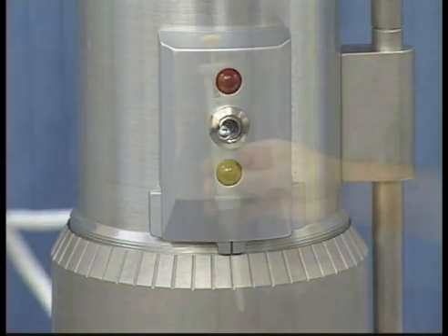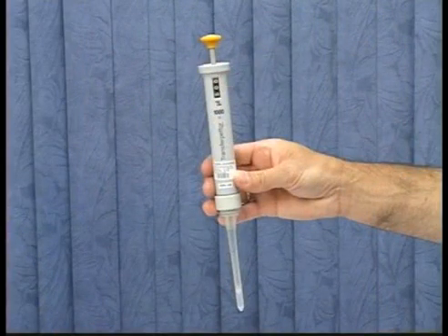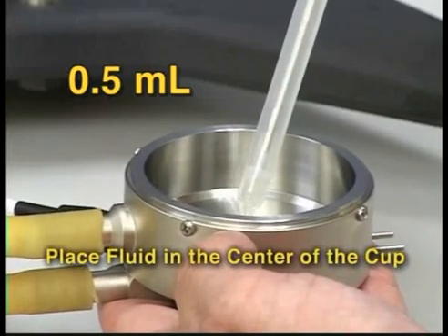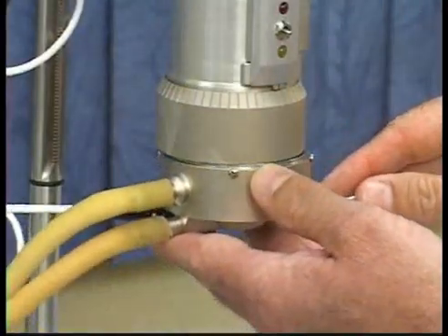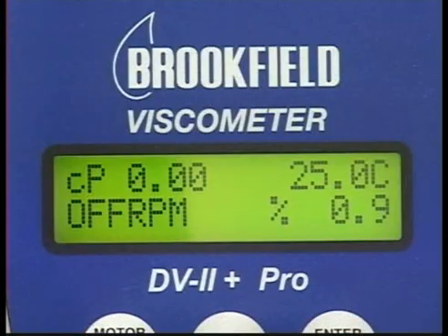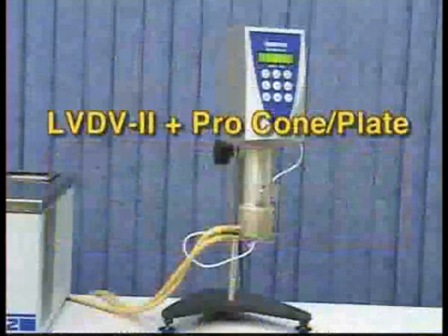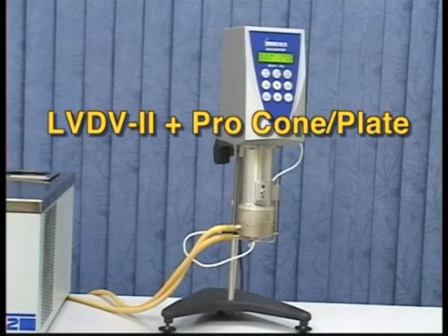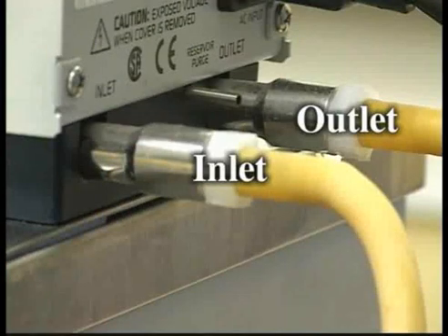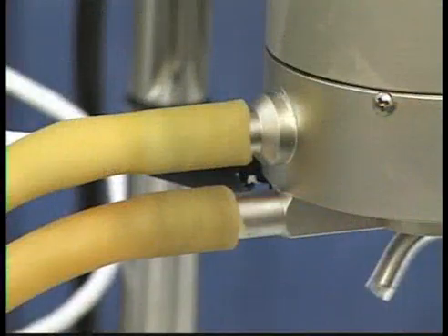With the gap properly set, measure the correct amount of viscosity standard fluid to be used — in this case 0.5 milliliter. The viscosity standard fluid needs to be equilibrated at 25 degrees Celsius to get an accurate reading. In this example, we will be using an LV DV2 Plus Pro cone plate instrument with a CPE-40 cone spindle.